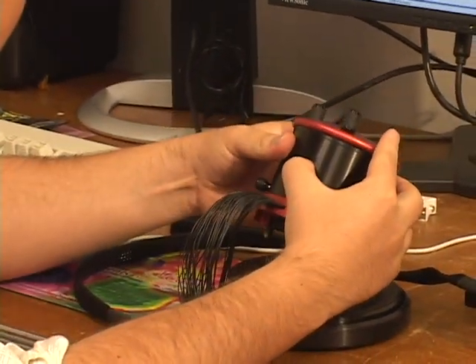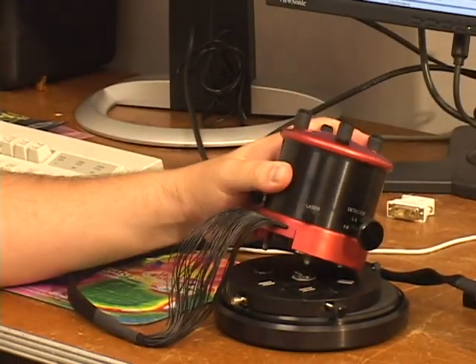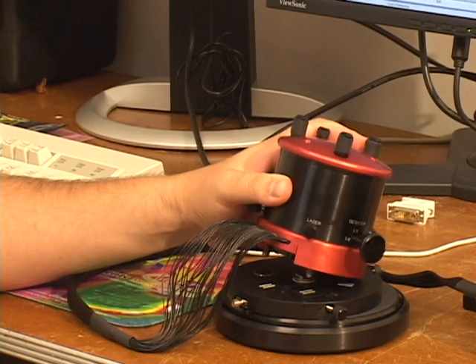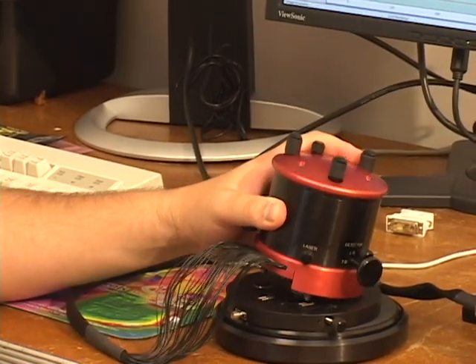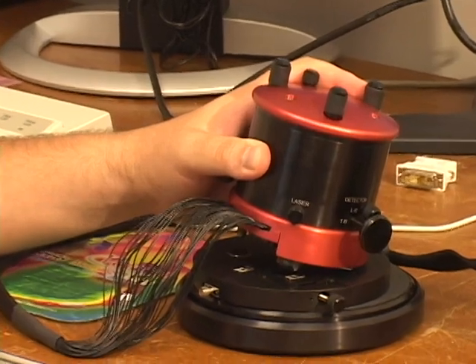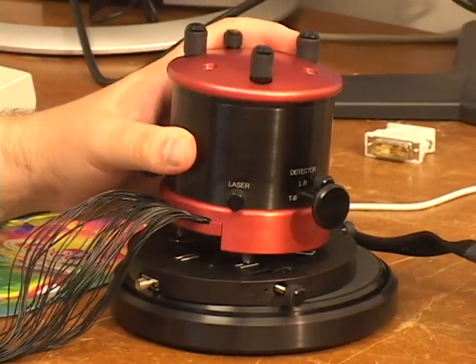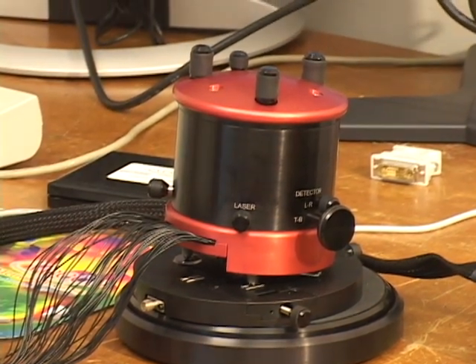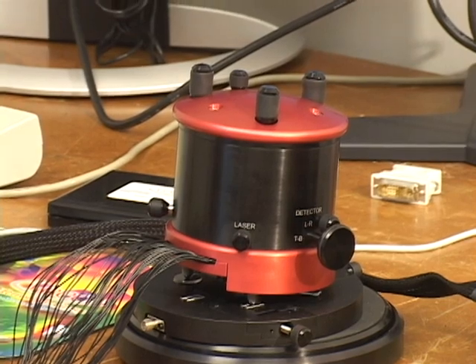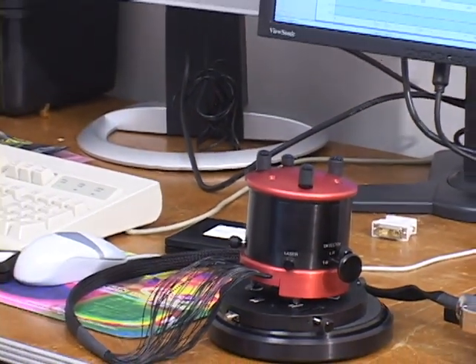After you do that, put the right one on the right leg on there between the 2 bars, move the X translation down on there, and afterwards you can just let the left leg go down, and we keep a safe distance between the sample and the probe. All right.